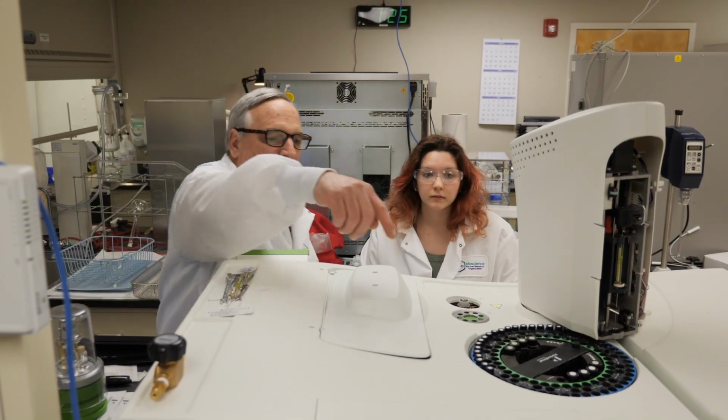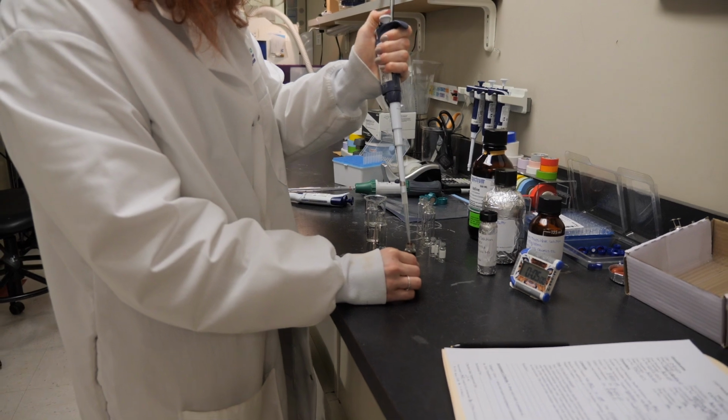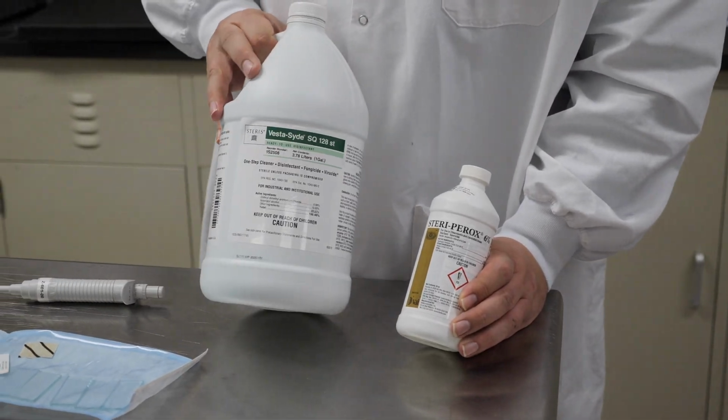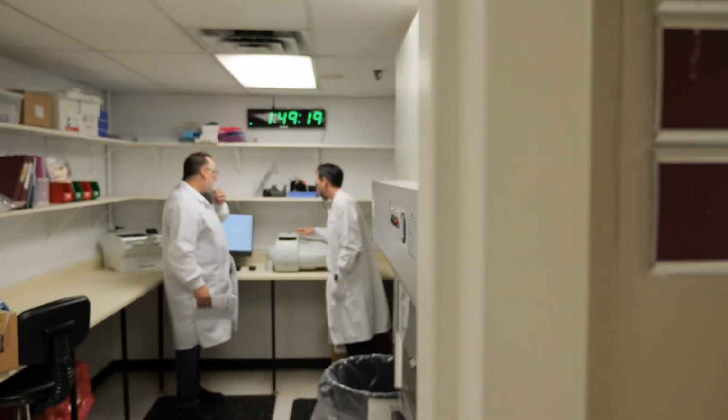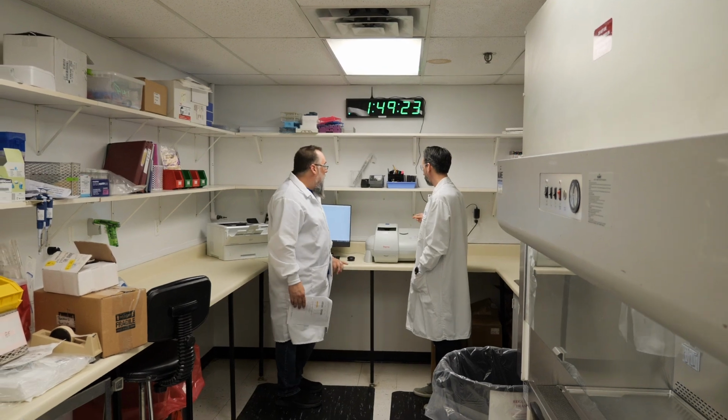All of our data is important to us, and it is our product. We want to make sure that it is valid and you receive all of the facts in that data, good or bad. Every time a manufacturing site is to change one of their disinfectants, they have to repeat this process against their facility coupons to ensure that the disinfectant is effective. This can happen multiple times over the course of a company's life, depending on which type of disinfectants they want to use on their facility.